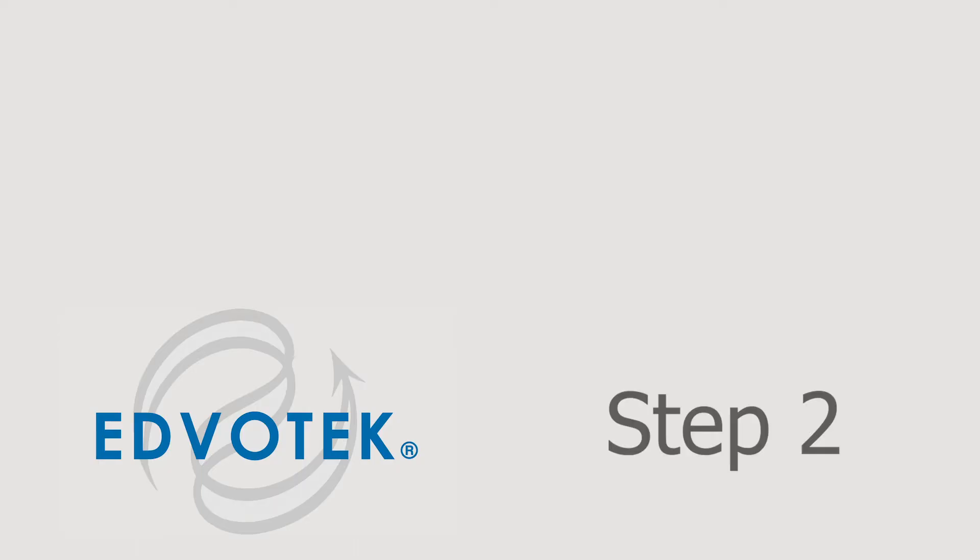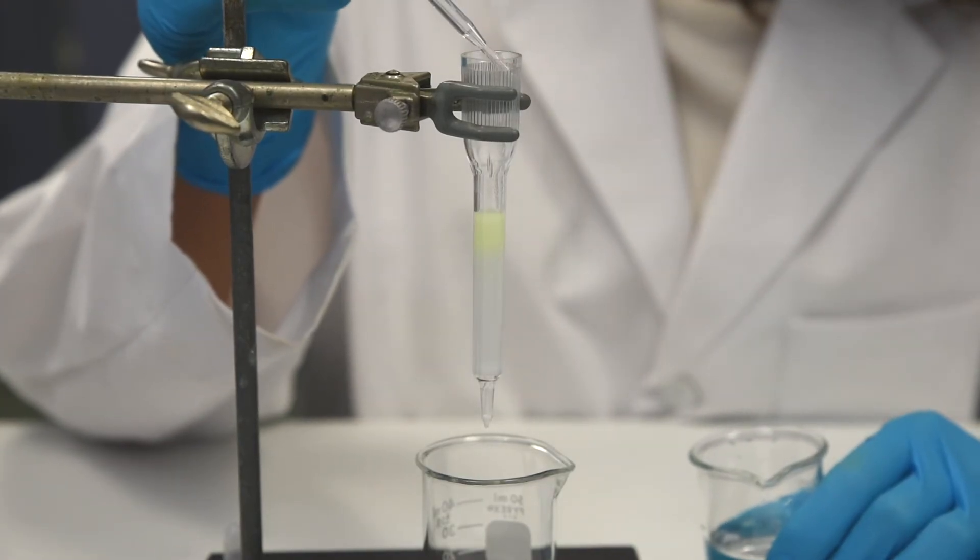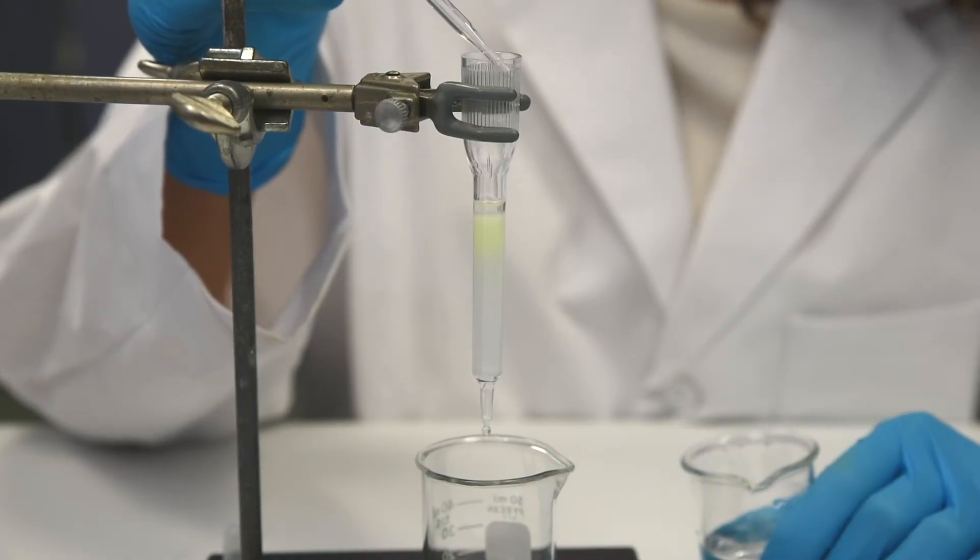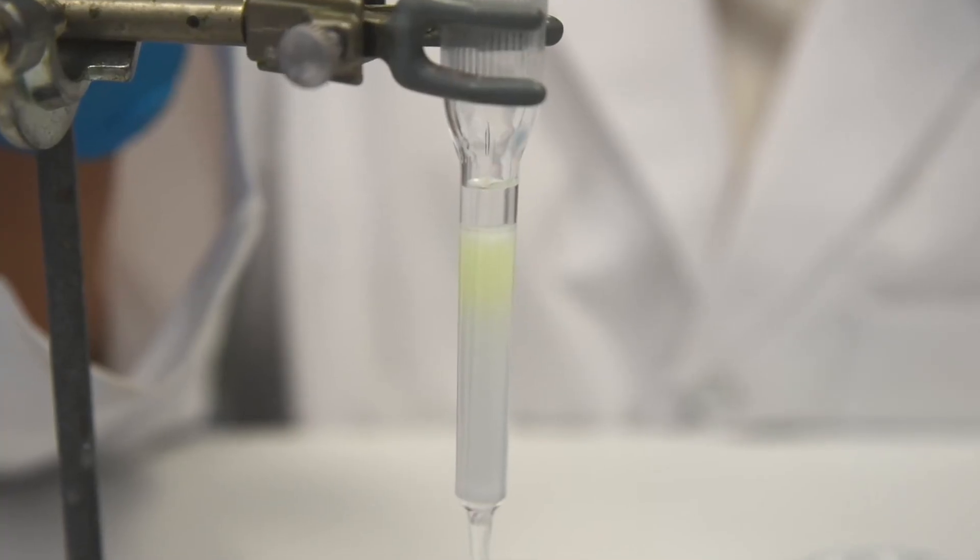Step 2: Begin to elute the column with 1x elution buffer. Add the buffer slowly, initially drop by drop, to avoid diluting the protein sample. Do not allow the column to run dry.